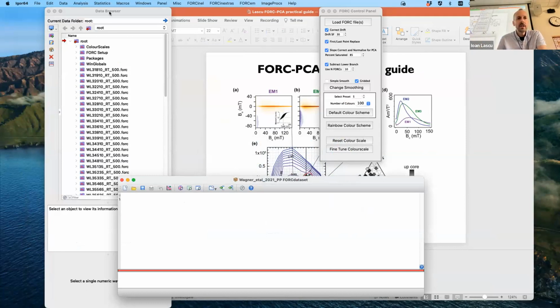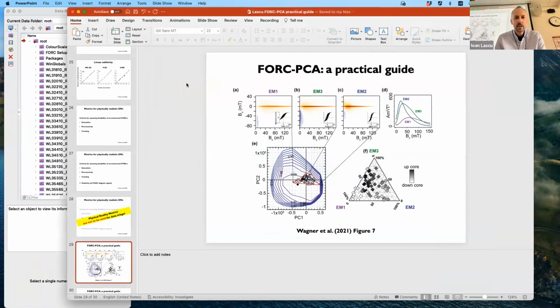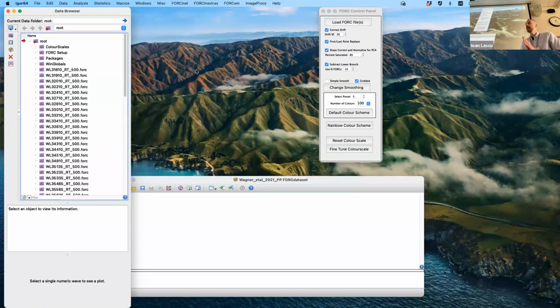Okay, so here's the data set. It's in Igor. Let me get rid of this for now. I just have a follow-up question to Max's, which is just sort of evaluating the significance of the difference of some of those end members, right? Because you're going to have more variability explained by PC1. So you sort of see this in this data set, right? That end member 2 and 3, which are the same in PC1, differentiating in PC2, look much more similar to one another, right?